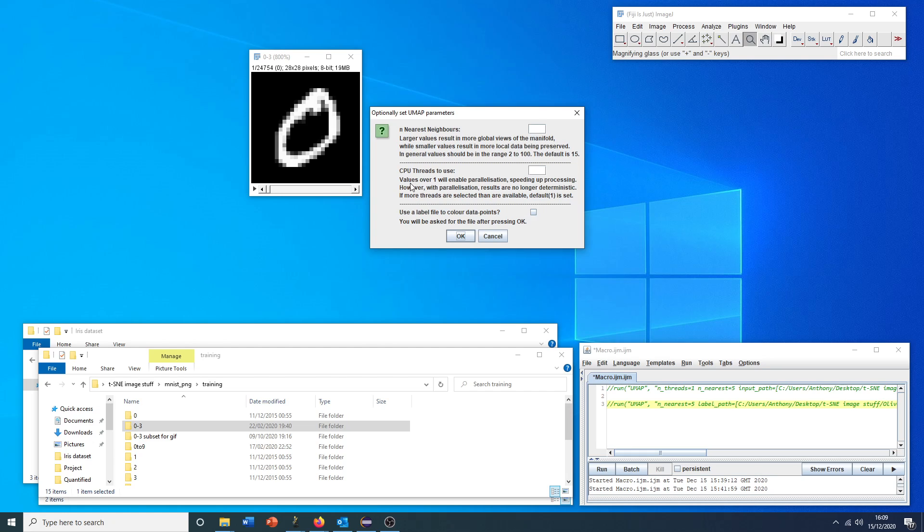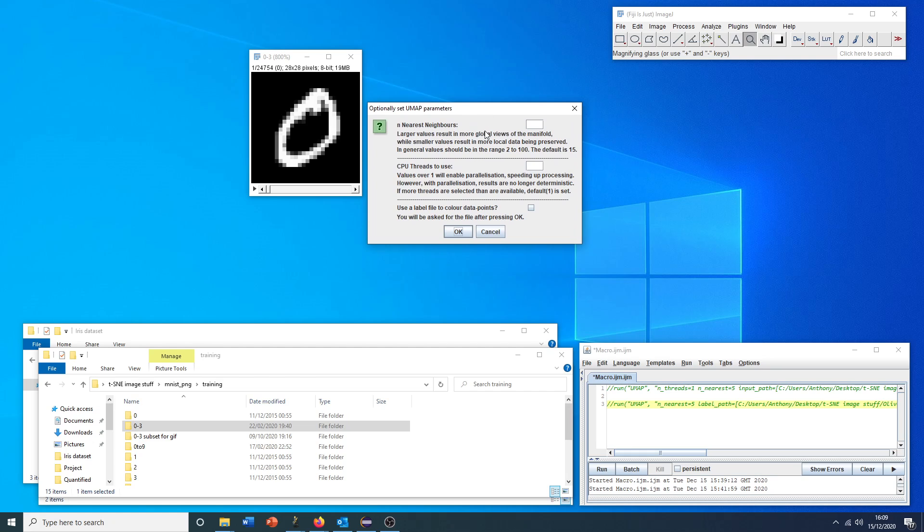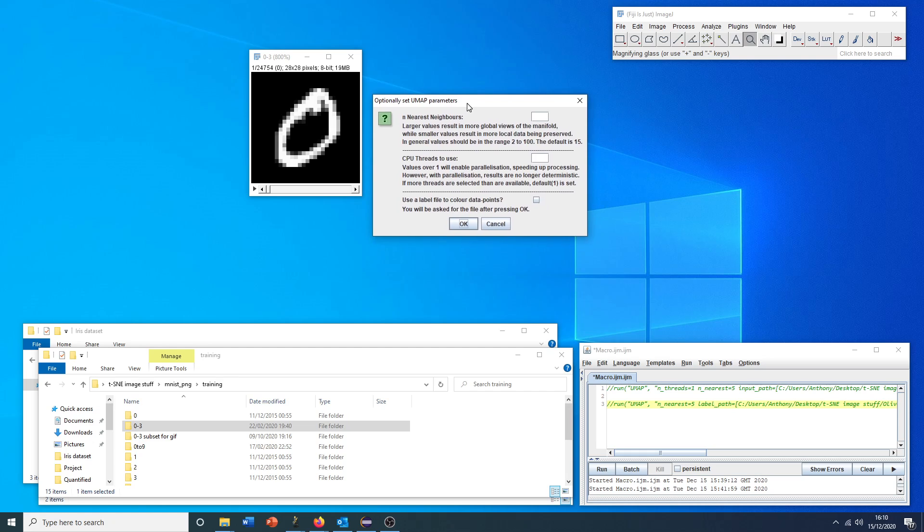We are asked or given the option here in this dialog to change some parameters. These are all optional, so it can run with default settings if we don't put anything in these boxes. But just a note that for CPU threads to use, this gives us the option of parallelization, which can use multiple CPU threads to significantly speed up the process.